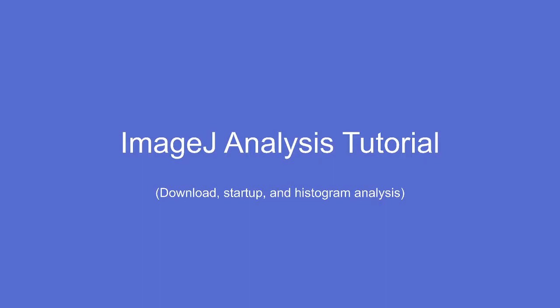Welcome to my ImageJ analysis tutorial video. In this video, I'll be showing you how to download the software, start it up, and run a histogram analysis.